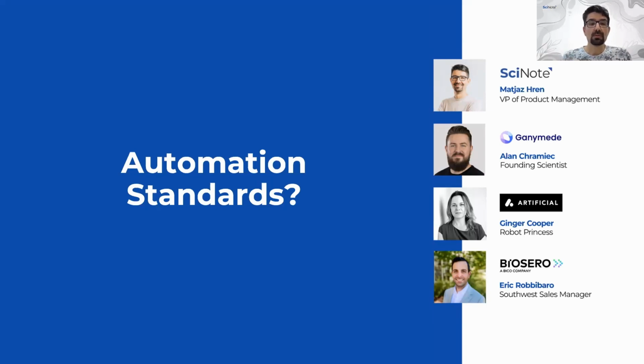So one approach was, in the absence of standards, what to do? You attempt to create one. I think the biggest driver for creating or promoting the data exchange formats was large pharma. They have a lot of challenges, and they also have a lot of resources.